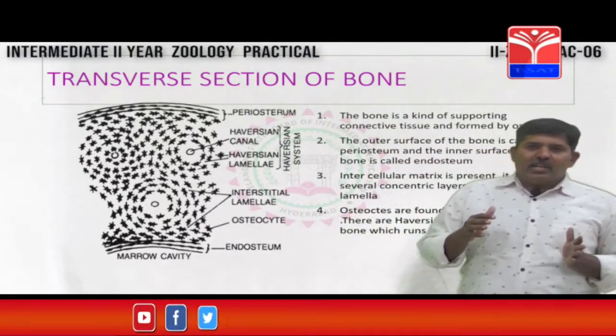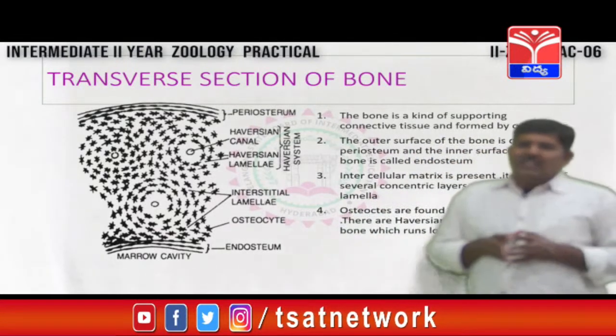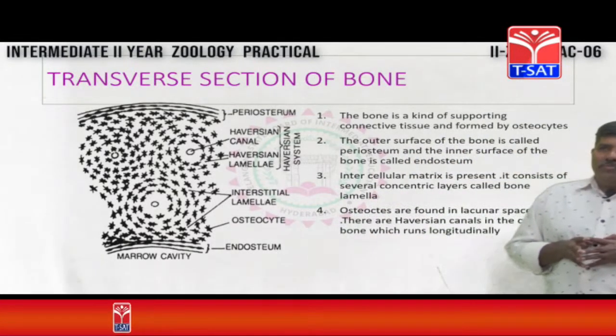The Haversian canals are connected by the Volkmann canals. So this is about the TS of the bone.